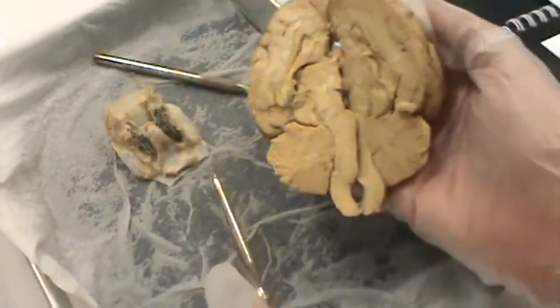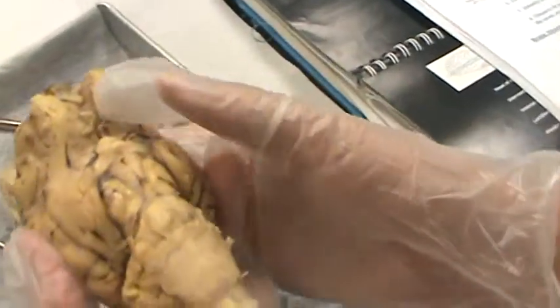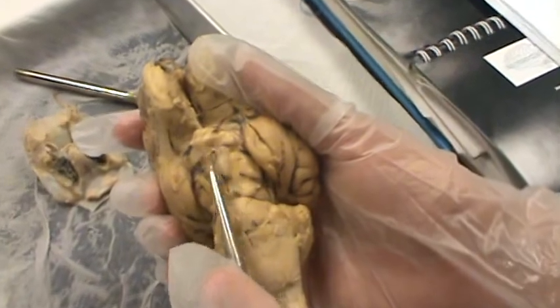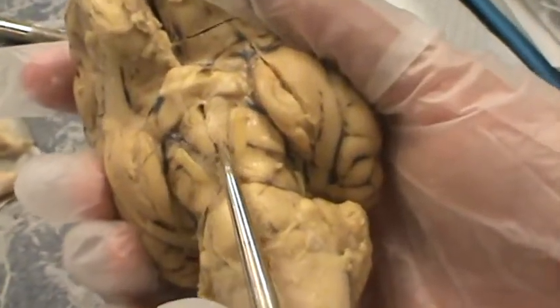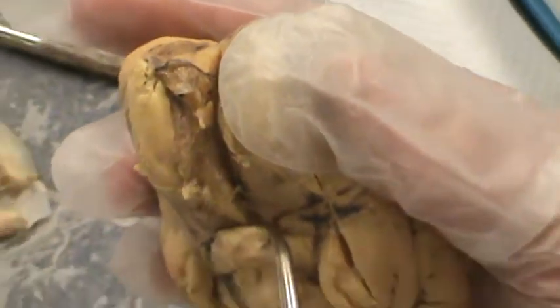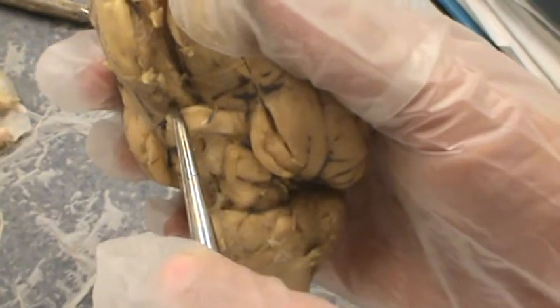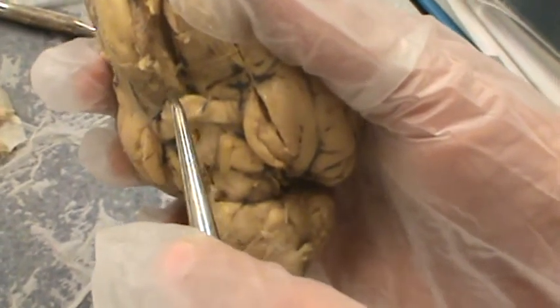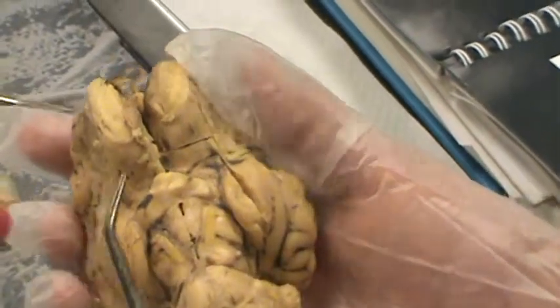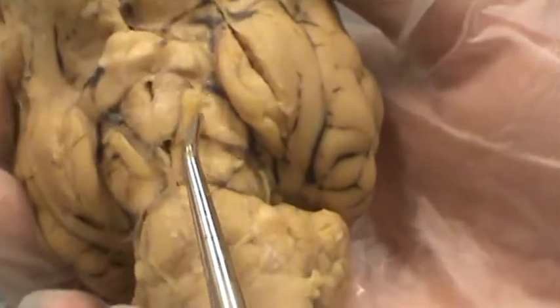The optic chiasma is the base of the X. And then the mammillary bodies are the bulbs, which are inferior to the hypothalamus. It's right there. Mammillary bodies.